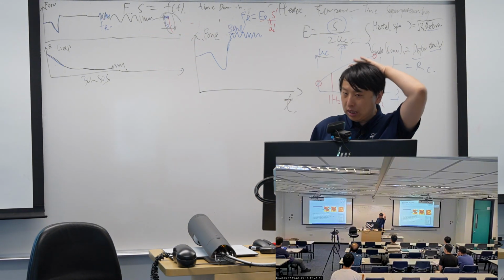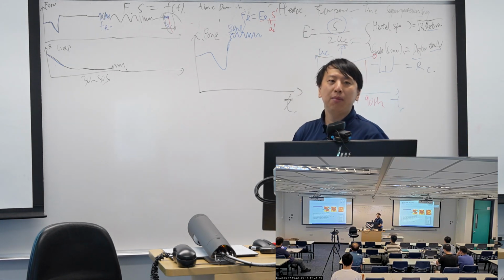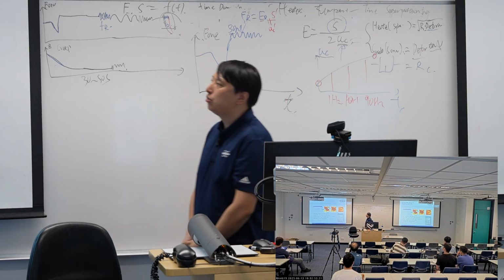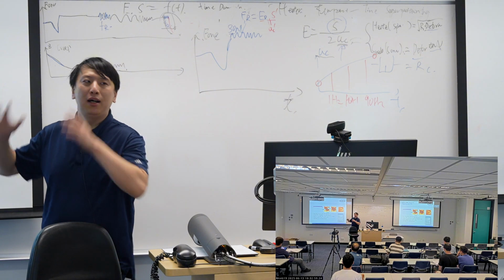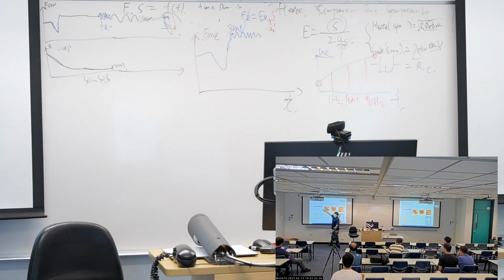And we can also use the nanoDMA to do mapping rather than just to generate a spectrum. And for mapping, we are using the force volume. On each force curve, we will add a ramp and hold.